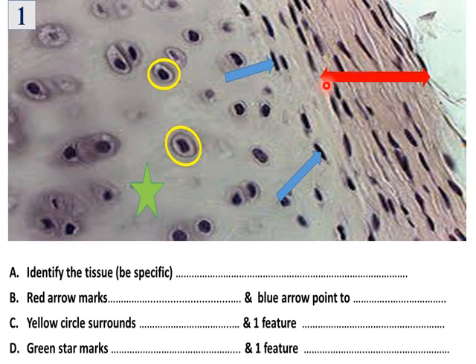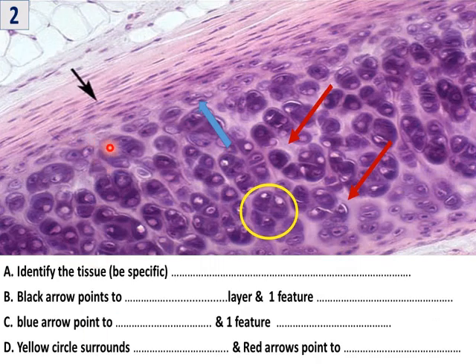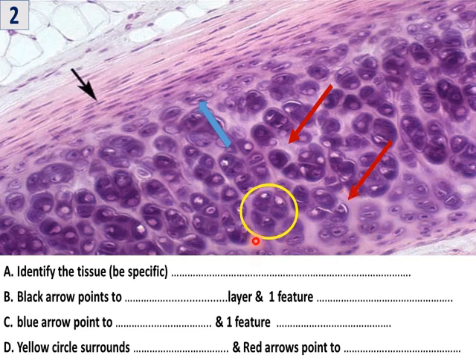The red arrow indicates the outer fibrous layer of the perichondrium, the blue arrow the inner chondrogenic layer or chondroblasts, and this is the chondrocyte and matrix. Another example of hyaline cartilage: the cell nest is formed of four cells and the fibers cannot be seen. Even if the matrix appears little, it is still hyaline because the fibers are invisible and the cell nest is formed of four cells — you can see many cell nests of four cells.